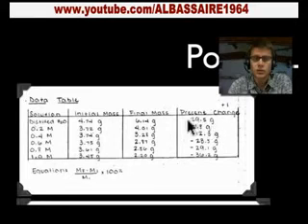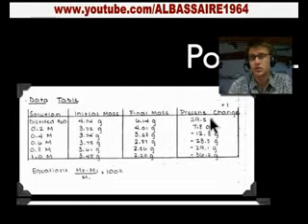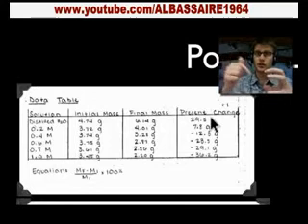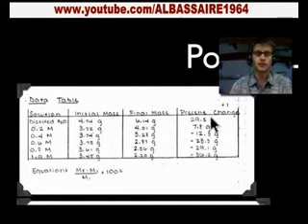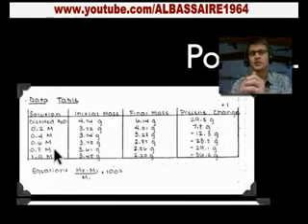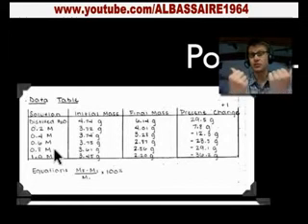And so you can see that when we put those potatoes in a hypotonic solution, in other words, distilled water, they actually gain mass. That means that they're swelling up. Why is that? It's because water is moving through osmosis into the actual potato. As it gets sugary and sugarier, then we find that the potatoes are actually shriveling up. What does that mean? It means that water is moving outside those potato cores.